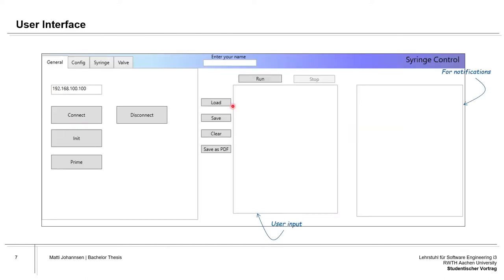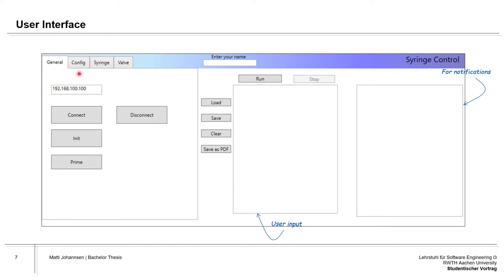Here we have the user interface. It consists of three parts. First of all, we have the tabs where the user in the general tab can connect to and from the syringe. They can initialize the syringes, which means that they are prepared for use, and they can also prime the system, which means that it's cleaned. In the config tab, the user can see the currently used mode of dispensing as well as the size of the syringes. In the syringe tab, the user can add commands to the user input or they can execute them manually, and the valve tab user can change the physical position of the valve.